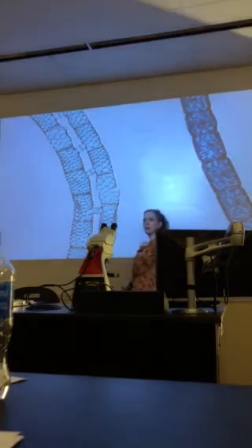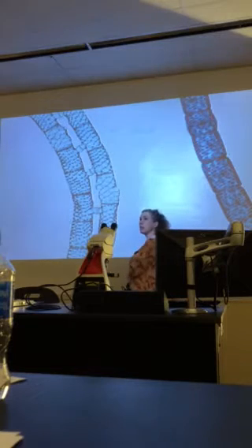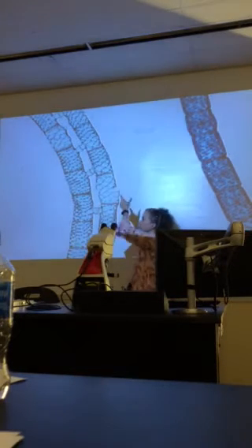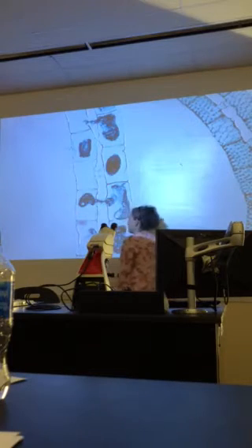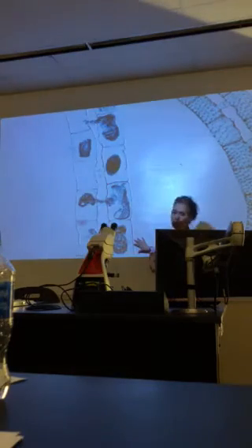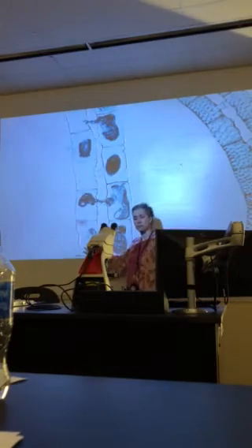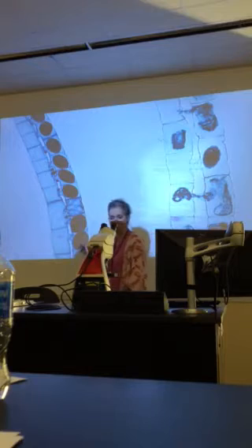What kind of algae is this? Green. Unicellular, filamentous, or colonial? Filamentous. As we move over into the series, I can now distinguish my filaments. Who is this filament? Positive filament. If you put female, it would be fine. Who is this? Minus or male would be fine. And when I get over here, what is this thing? A zygote. Any questions?